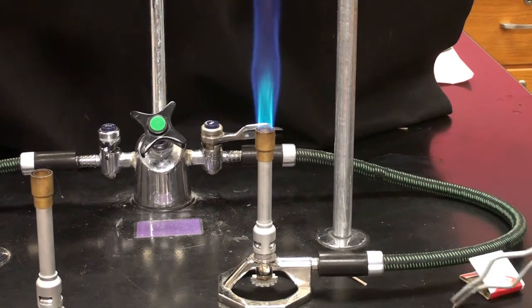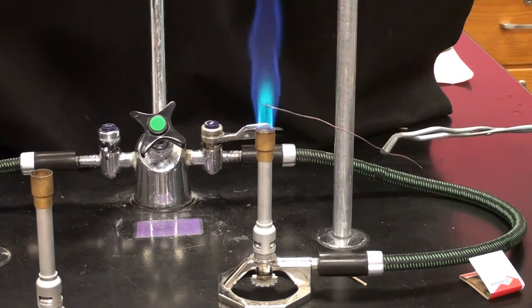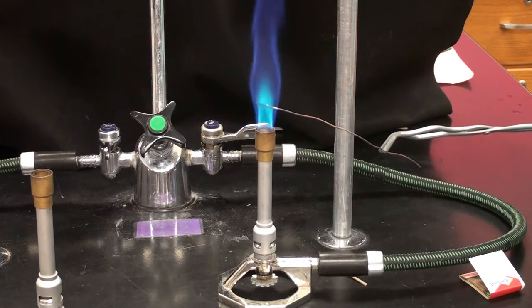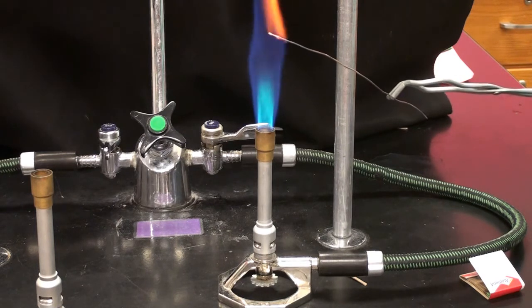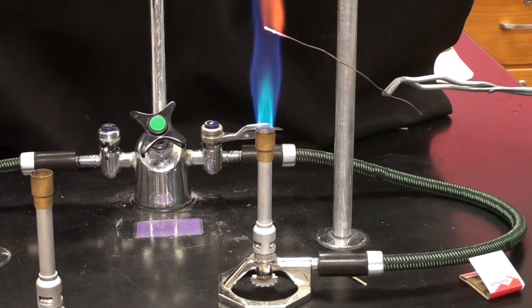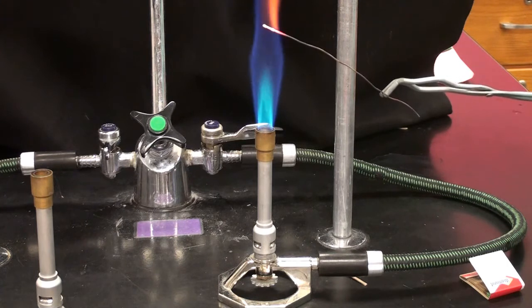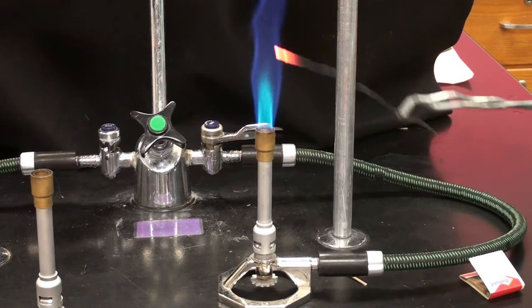I've got another wire over here. This one's copper. This one's harder to melt than the aluminum. We have to look up its melting point as well. Once again, down here at the bottom part, it's not going to be hot enough to melt the copper. You've got to go up to the very tip-top section and stay up there for a while. And even then, it's hard to get the copper to melt. It's glowing really well right now, and it seems like I'm getting a little tiny bead of liquid there, like a little round bead at the top.